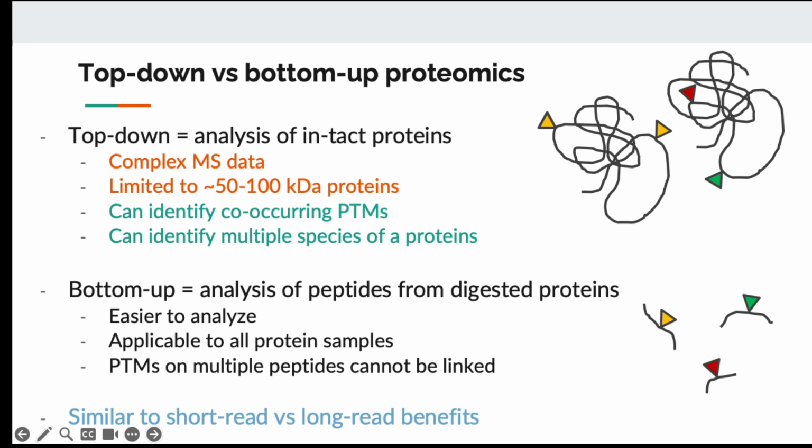Okay. So these are the choices that you have to make even before you design your proteomics experiment. You have to think about this factor. It's a good thing, because you have more choices than if you perform transcriptomics. You have more choices about which protein to focus on. Do you want to focus on identifying the protein, or confirming the PTM, or distinguishing protein species?